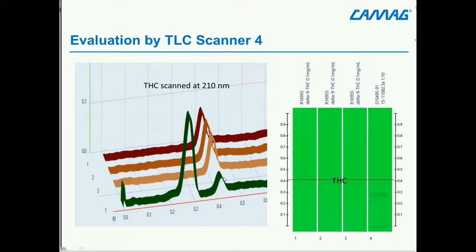So for total THC content, you have to quantify this and this peak, or you do the decarboxylation during sample preparation and you will have one target peak to analyze. If you just analyze this, then it would say, okay, it's less than the set limit. But if you quantify the total THC content, then this sample would fail.